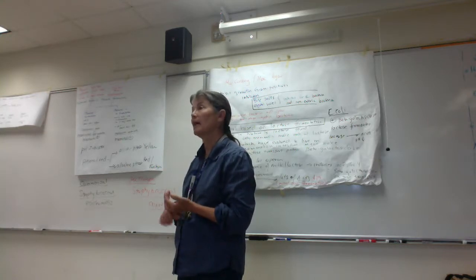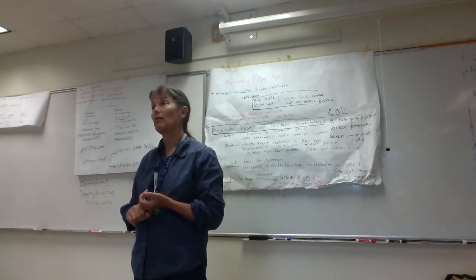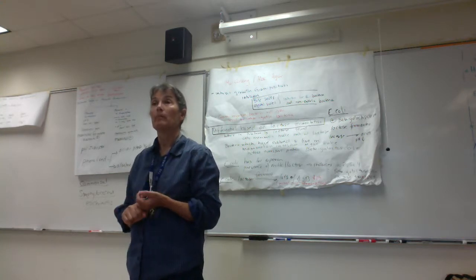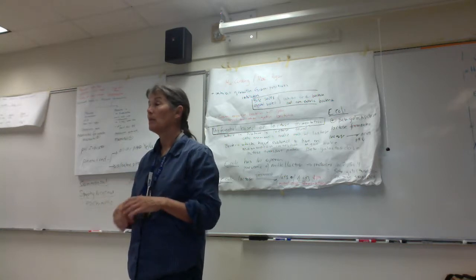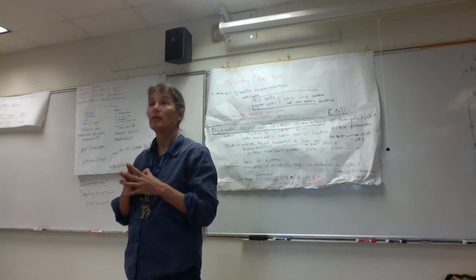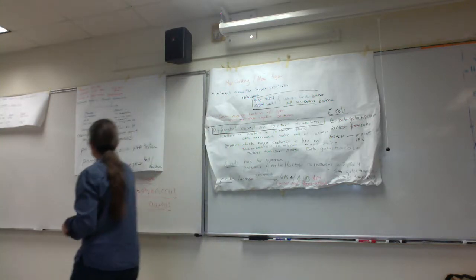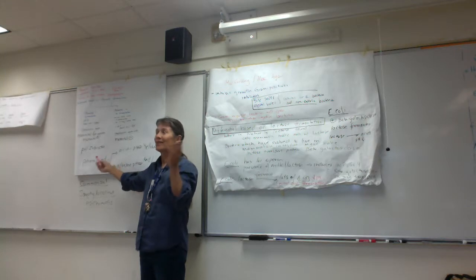The reason it's called mannitol salt agar is it has a sugar alcohol, mannitol, incorporated into the medium. So if microbes can ferment mannitol, they'll make acids and drop the pH, right? So the way we're going to detect that is by incorporating a pH indicator. And the one we incorporate in mannitol salt agar is called phenol red. And phenol red, you guys, the pH indicator, is so much fun, they change colors.